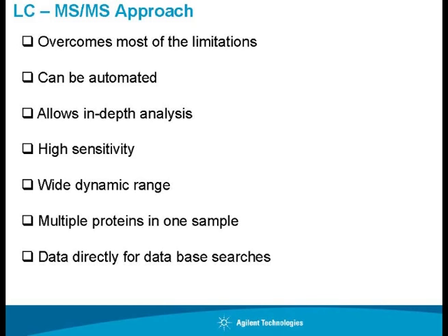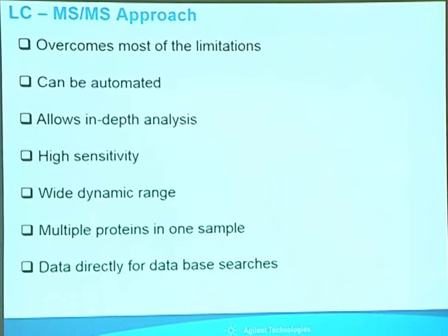Basically, because it can be automated, you can do multiple runs. You need not sit there and do it. You run overnight and in the morning you can compare results and see what is happening. It allows in-depth analysis, it is highly sensitive, it has wide dynamic range, okay, and you can run multiple proteins in one sample at a time. It is also compatible with database searches, like data as such can be submitted into a database and you can get the identity annotations.